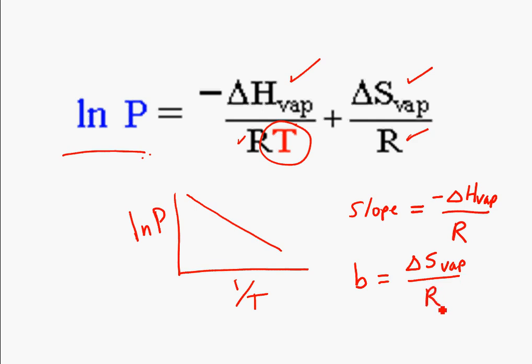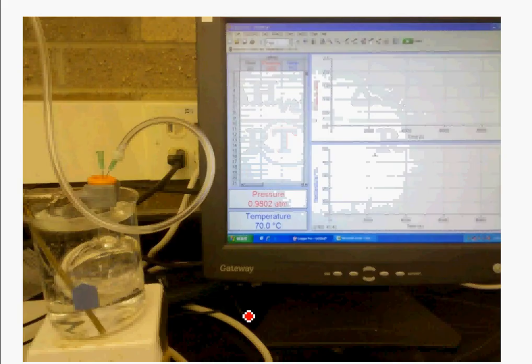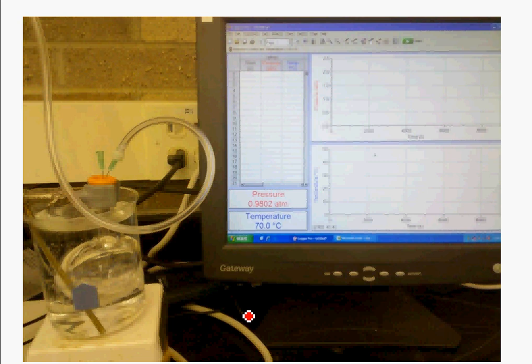So the math to get us this data is going to be kind of a pain, and we'll talk about that in the actual lab. I want to spend this screencast talking about the actual experiment. The way I'm going to do that is step through some experimental pictures, if you will. So here's our experimental setup.